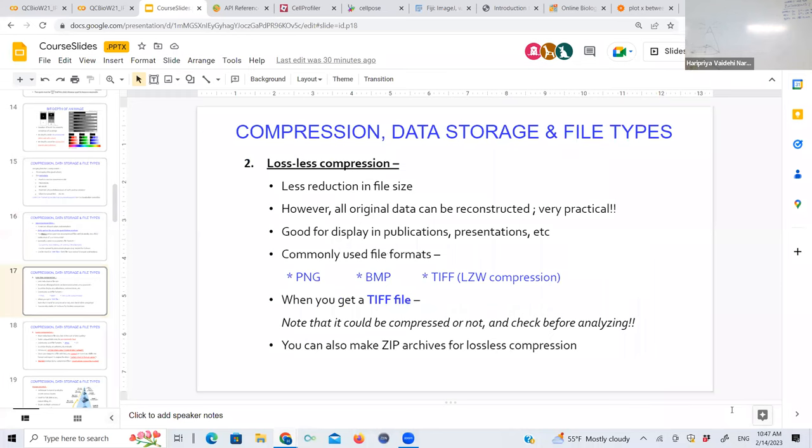The second thing you can do, if you just want to package your images and share them with somebody, and you don't care so much about the accuracy at that point, is lossless compression, which compresses it in such a way that you can always reconstruct the original data from whatever compressed thing you have. The algorithm works in that way. I'm not going to go into the details. You won't get too much of a reduction in file size. You won't go from 5 GB to 10 MB. You'll go from maybe 5 GB to 2 GB, which is significant. But if that's not what you're looking for, too bad.